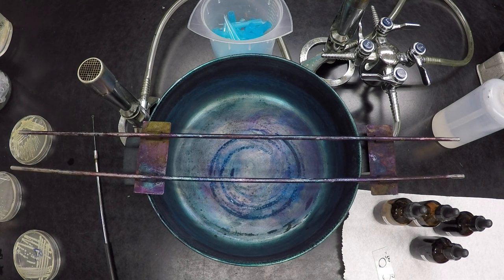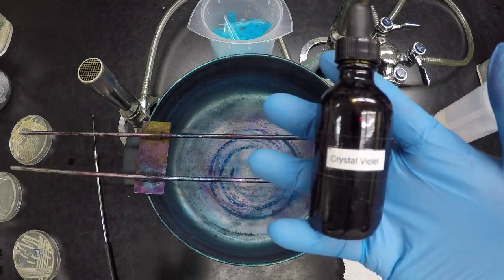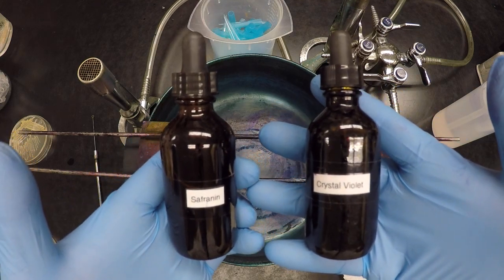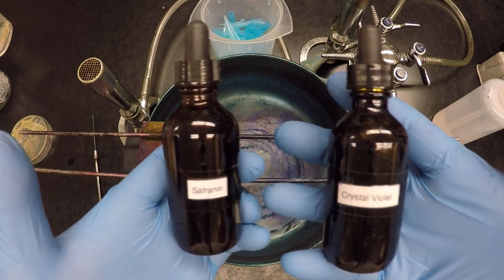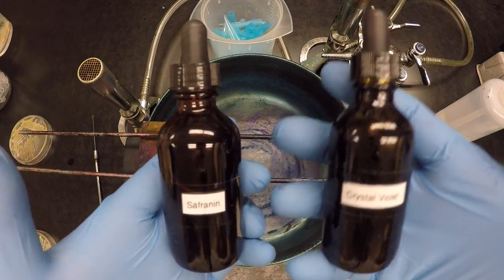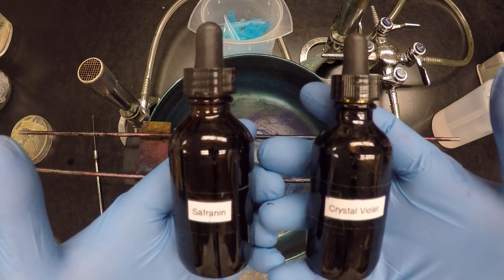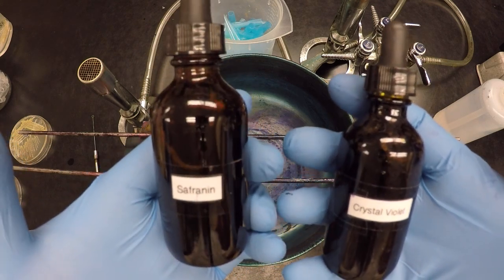In any type of differential stain, we'll always have at least two dyes. One is the primary stain, in this case it's crystal violet, and one is the counter stain, and that's safranin. Now, the way differential stains work is that whatever is going to be positive will stain with the primary stain, right? So our gram-positive cells will be crystal violet, and the ones that are negative will stain with the counter stain, right? And in this case, it's our safranin.